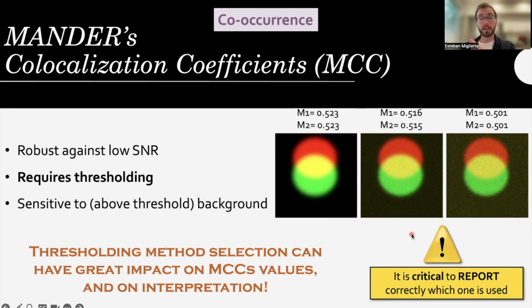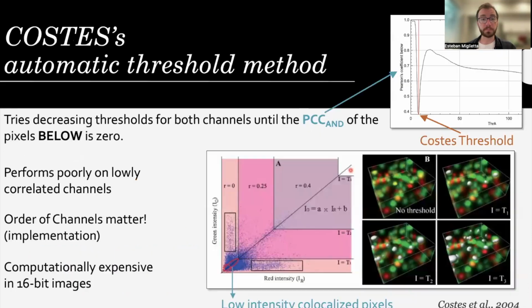Again, here, there is no correct answer on which threshold is the one to use, but it's critical that it is reproducible and thus that you can report it when you report your results.